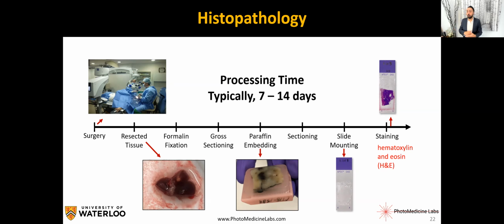So there are intraoperative ways, for example, frozen sectioning, but here I'm looking at the gold standard. The gold standard, which is basically the H&E paraffin-embedded method, is the fact that eventually we need to remove the tissue, either by biopsy or during open surgery. Eventually you remove the tissue and you end up with fresh resected tissue. The gold standard, again, is to put this tissue inside paraffin.